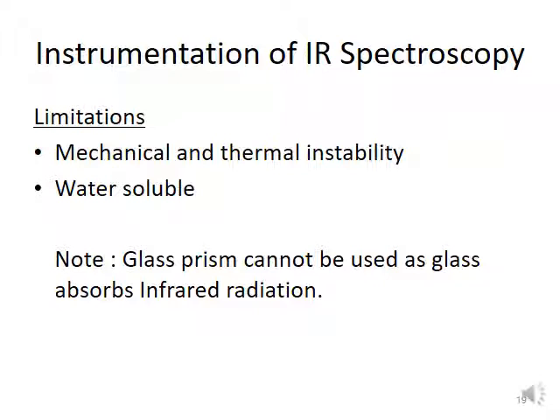In this case you can see a very broad peak that represents the OH minus, even though the real sample doesn't contain any OH minus. So this is the problem that always occurs when you try to run using infrared spectroscopy.